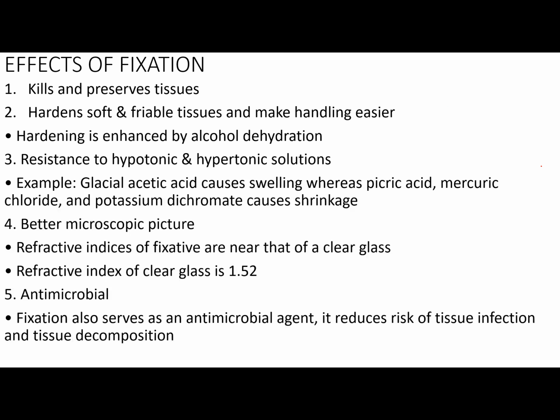Now, what are the effects of fixation sa tissue, class? It would kill and preserve tissue. Harden soft and friable tissues and makes them handling easier. So hardening is further enhanced by alcohol dehydration. So a necessary step, class, after fixation, if hindi ka magde-decalcify, is that you would proceed to dehydration. Dehydration is done, class, para ma-harden yung tissue. Kasi nga, you have to make the tissue hard so that you could process it easier.